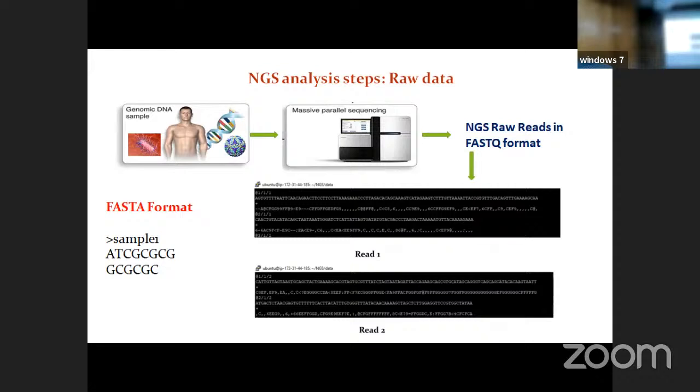Therefore, transcriptome analyses are not performed in terms of genes. Genes are reported only for our understanding, but actually transcriptome analysis is performed based on transcripts or probes. If you are going for microarray data analysis, you will find probes. If you go for NGS data analysis, you will find transcripts. There might be 1 lakh, 1.5 lakh transcripts. Out of that, how many transcripts are distributed? Later on, how will you communicate that in a publication? For that reason, we are using gene symbols.